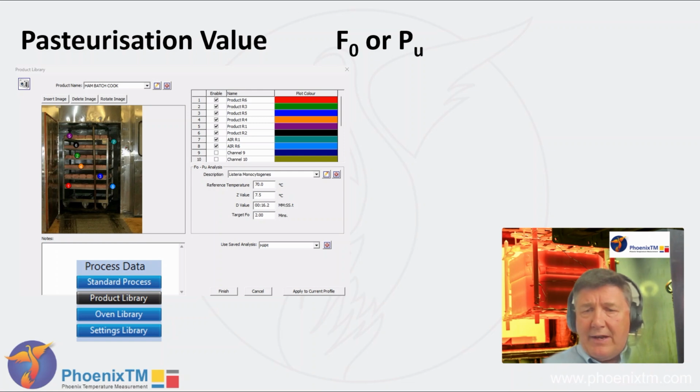My recommendation is, if you do not know what they should be, consult technical resources, academic press, and consultants that work in the industry. At no point should you use parameters that you are not confident with that may or may not apply to the product or the processing that you are implementing in your cook or your cook monitoring.